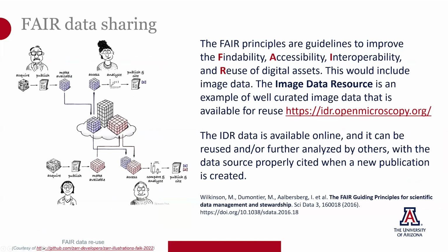There's a movement in science to move towards making data more findable, accessible, interoperable, and reusable. And this cartoon shows, people acquire data, but sometimes when they make it available, other people can use it and sometimes use different data sets and combine them and come up with new information while citing the source of the original data.